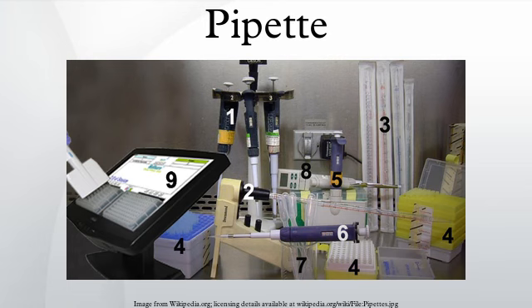Nomenclature: although specific descriptive names exist for each type of pipette, in practice any type of pipette will merely be referred to as a pipette, and the desired device will be obvious from context. Sometimes, pipettes that dispense between 1 and 1,000 microliters are distinguished as micropipettes, while macropipettes dispense greater volumes. Common pipettes: air displacement micropipettes.